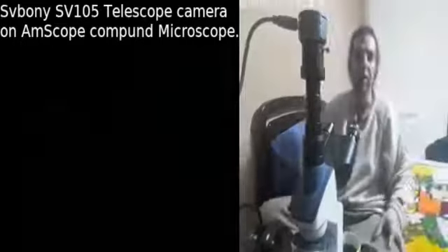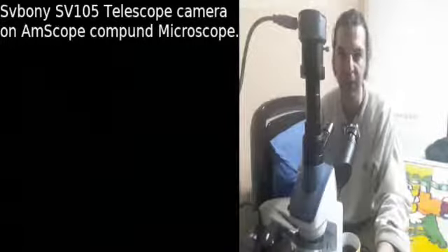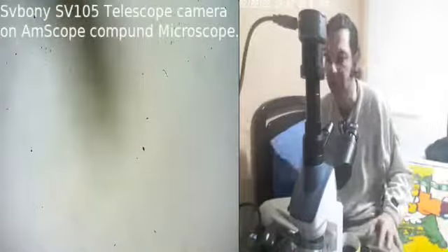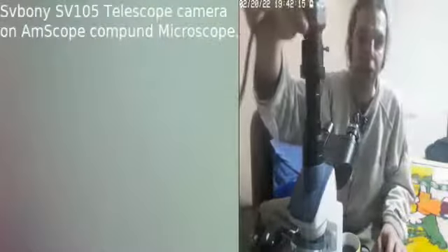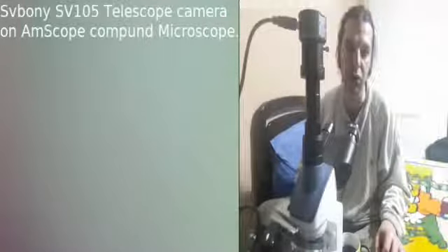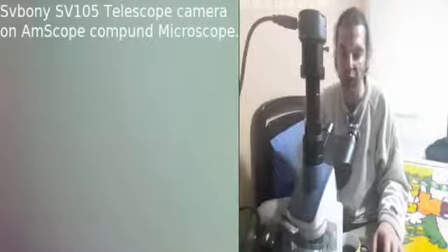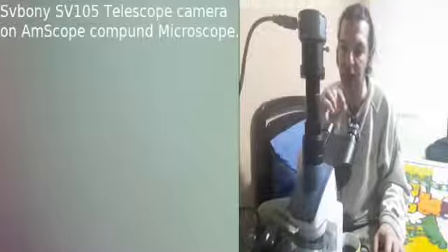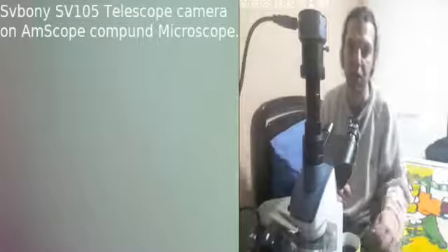I'm going to show you how I installed it. We turn on the microscope. This is the camera here, which is in gray. Please don't criticize the image quality. The camera I'm using has a little damage because I use it to take pictures of the Sun and sunspots using my own telescope.